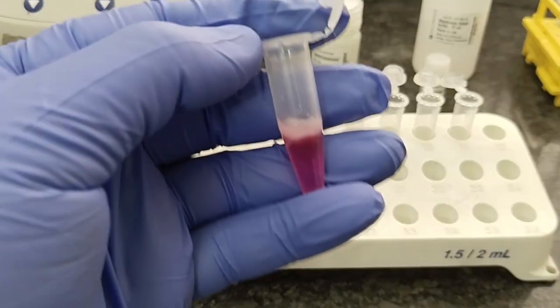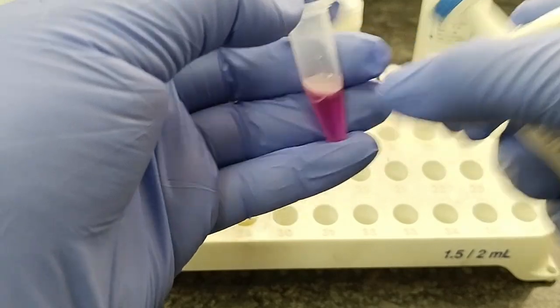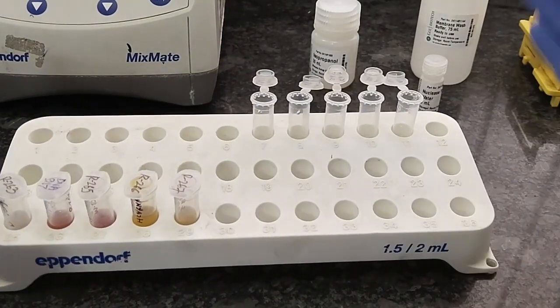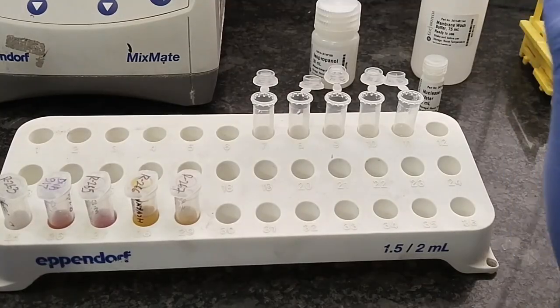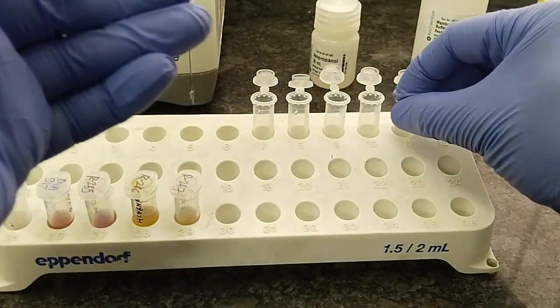We have to collect only the aqueous phase, not the interface or the organic phase. So all the aqueous phase is collected in the corresponding tube.